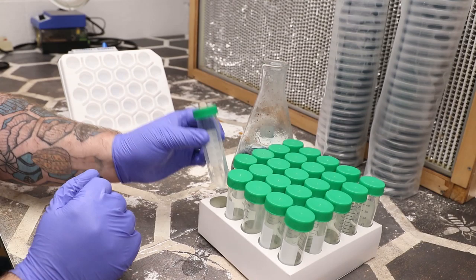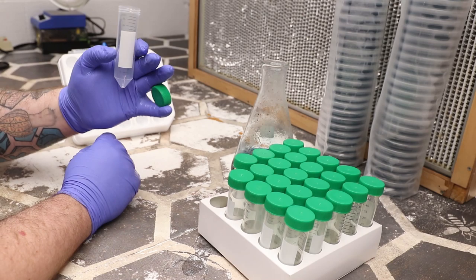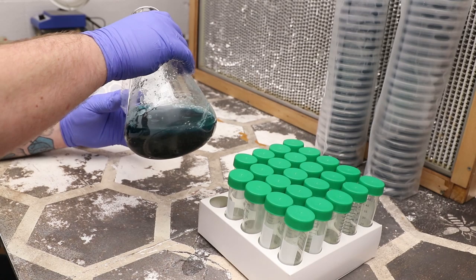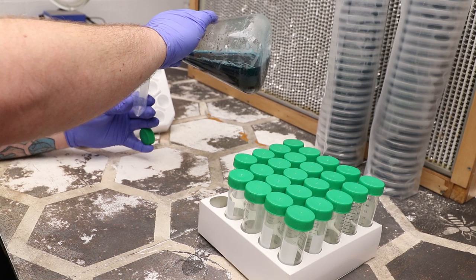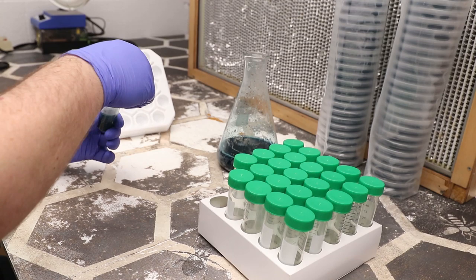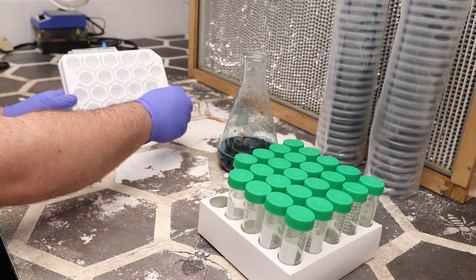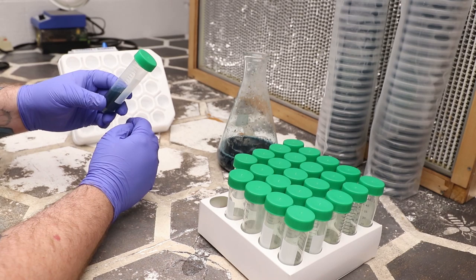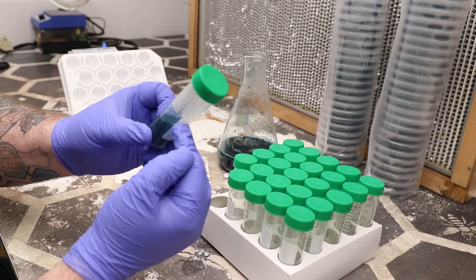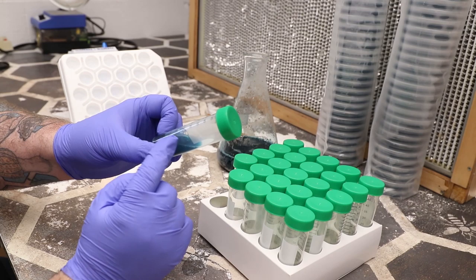I'll fill each one up to right between the 15 and 20 milliliter line. I hold my cap like that, face the numbers towards me, and then just pour, close it up all the way, and set it in. A little tip I've learned recently - I like to get mine angled so I can put my label there. After I label these things after they've been inoculated, I will still have the clearest view possible of my mycelium growing.